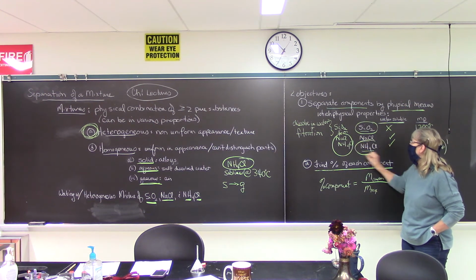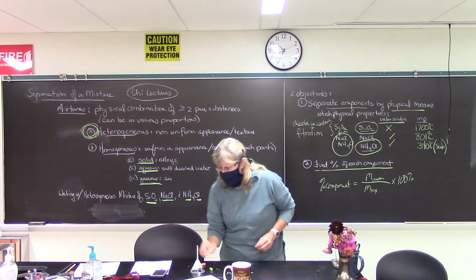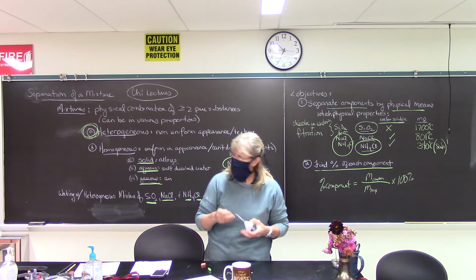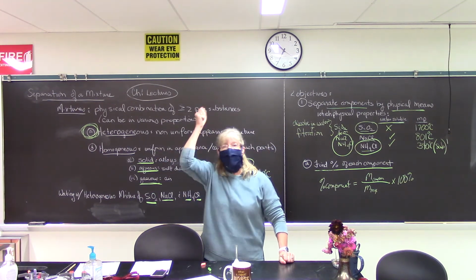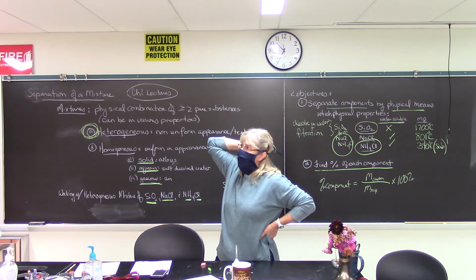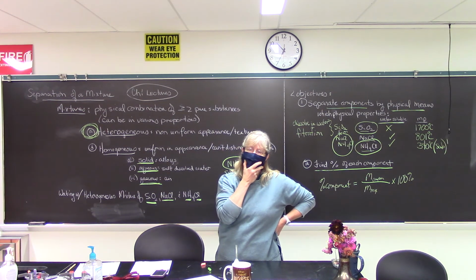How are we going to find the mass of the ammonium chloride? Well, I suppose I could scrape it off of here and maybe use a paper clip or something to scrape it out of there. And then I could go into the hood and scrape it off the sides of the hood. And then I'd have to go up the hood and try to get that bird that was dead on the roof. And no, that's not going to work for just so many reasons.